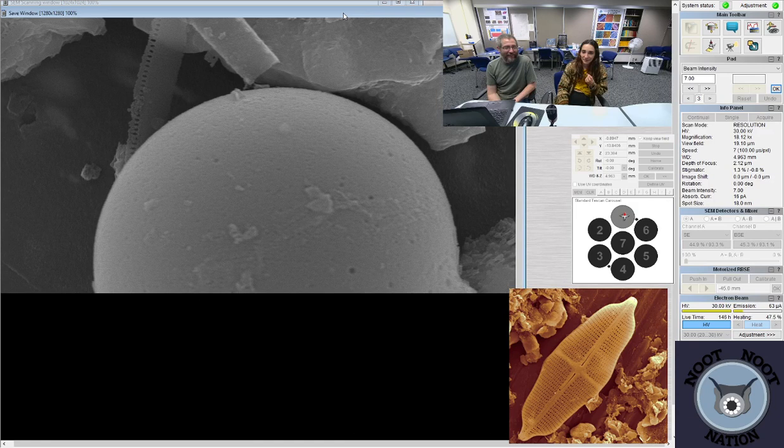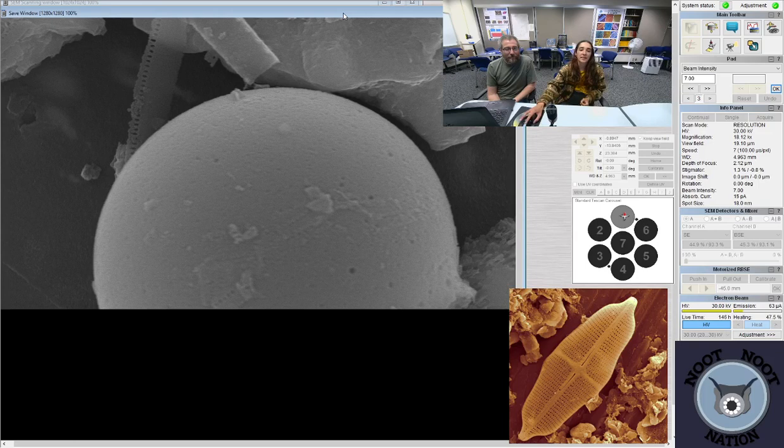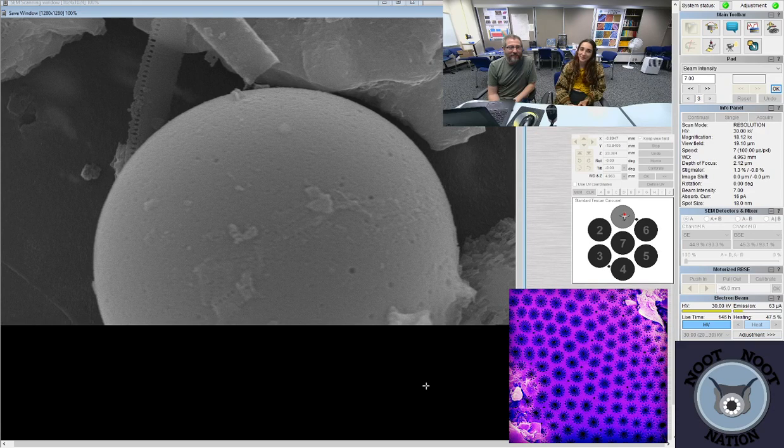What are you looking at? It's a nice chrysophyte. I like them. I took a picture. It's a little Christmas tree ornament. Yes, a stomatocyst. Now that I know what they are, I love them.